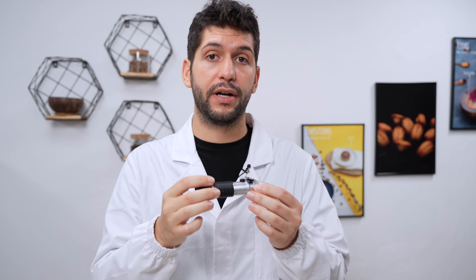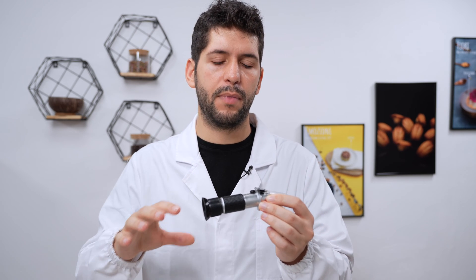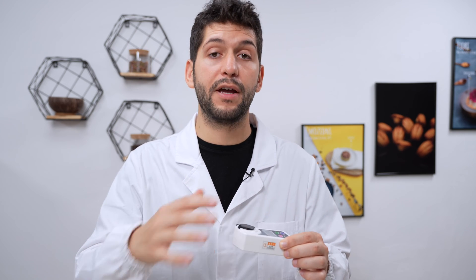One more thing to consider: the refractive index of water changes with temperature. With a very simple refractometer, you must ensure the liquid being measured is always at the same temperature — generally 20 degrees Celsius. More advanced analog or digital refractometers can compensate for different temperatures by also measuring the liquid's temperature. With a refractometer, we can measure the amount of sugar in a sugar syrup, and it's very useful for measuring sugar content in fruit.